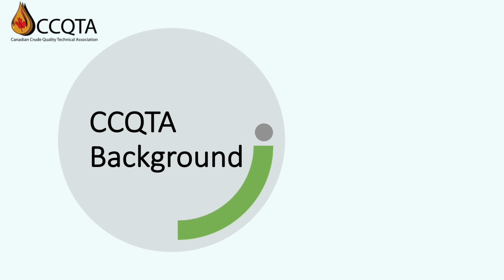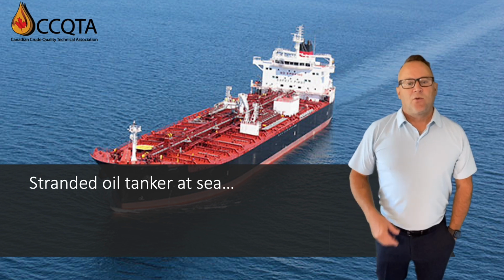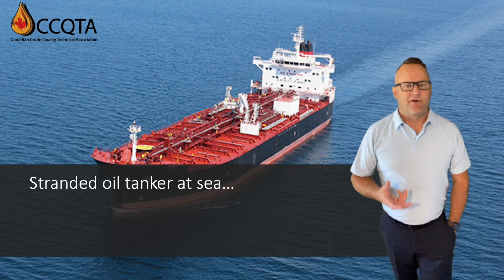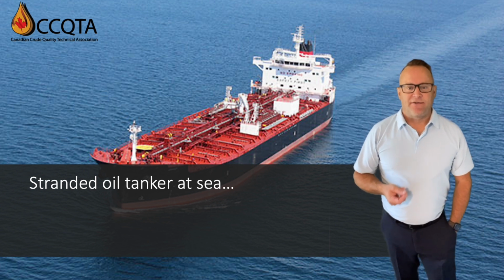Why, as a technical organization, did the CCQTA get involved with H2S? It all started for the CCQTA with an oil tanker stranded at sea with no port willing to accept its crude oil cargo because of the H2S testing results. When the cargo was loaded at the departure port, one testing method was used on the crude, and that method reported in ppm by mass and met the specification of the receiving port at the time.